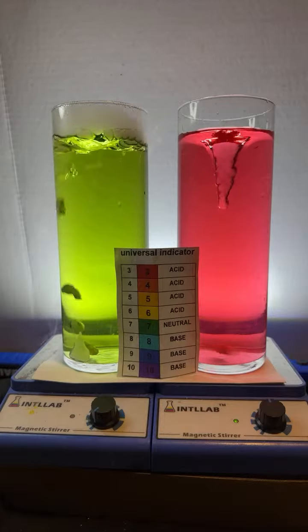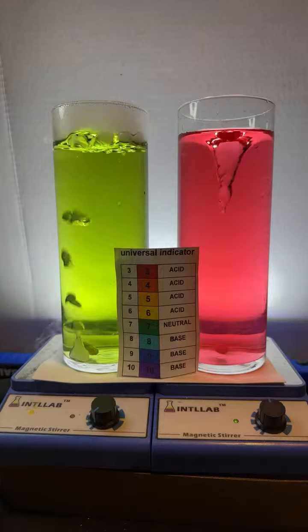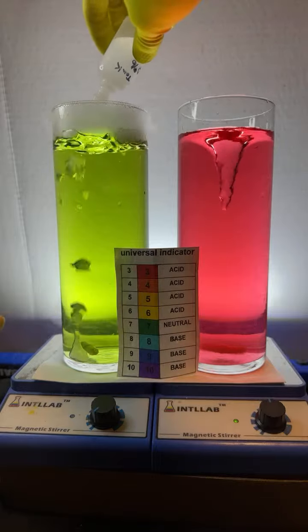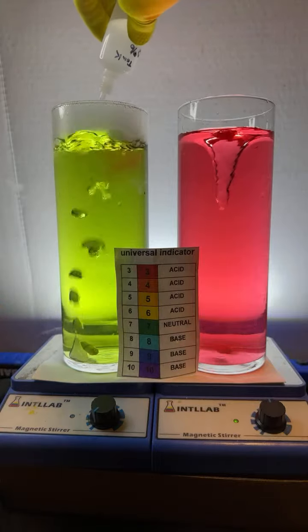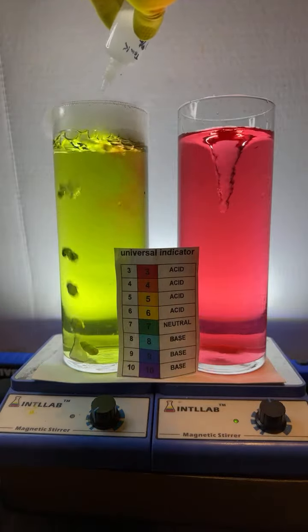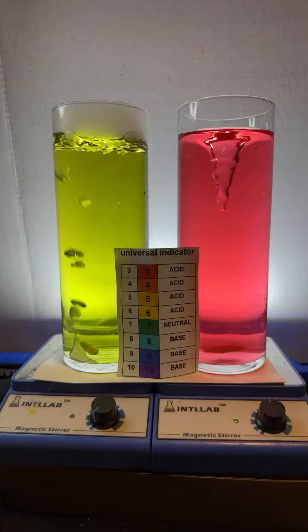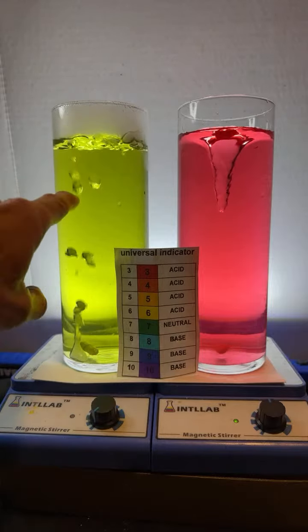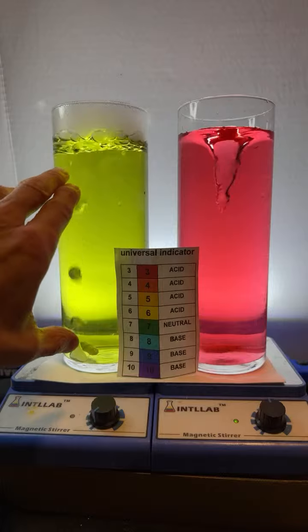So does the acid mean it has more electrons? No, an acid, the way we chemists... Okay, here we go. Someone asked to add acid to this side over here, and in goes a little more acid. So really what we end up having over there, for any chemists in the chat, you might notice we have a buffered system now.